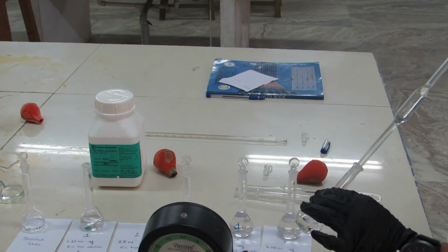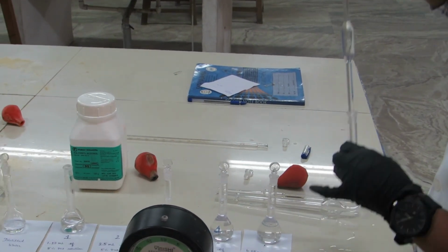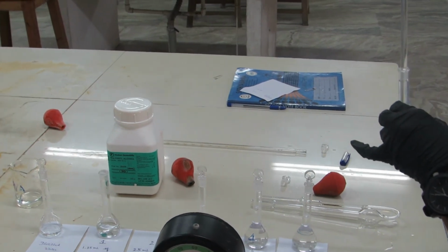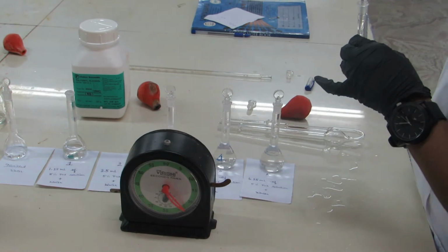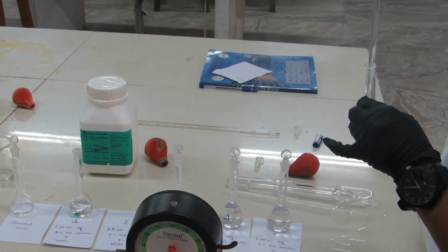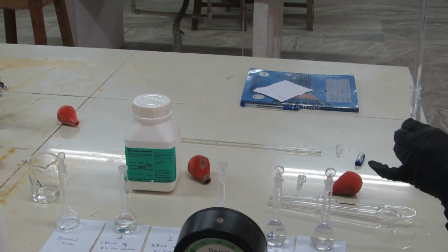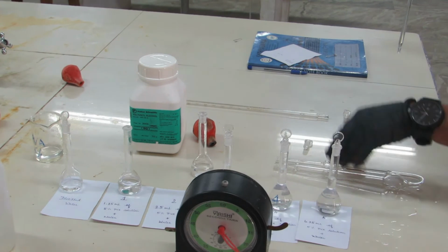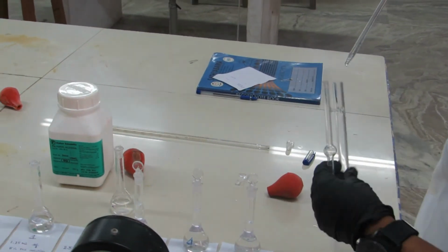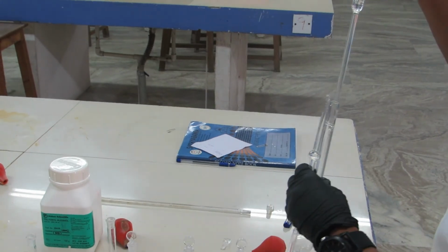Okay, each time it is not necessary to wash our viscometer. The reason is we are doing our experiments from lower concentration to higher concentration. The effect of the washing may not be an influencing factor in this case, because we are doing our experiment from low concentration to higher concentration. It is not necessary to wash.